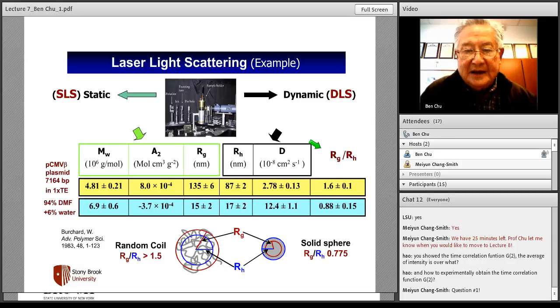The other thing one must remember is, for light, and the same thing for the others, but I'm more familiar with light, that for small particles, as the particles become larger, you can think about the polarizability or the volume. The intensity is proportional to the 6th power of the size.